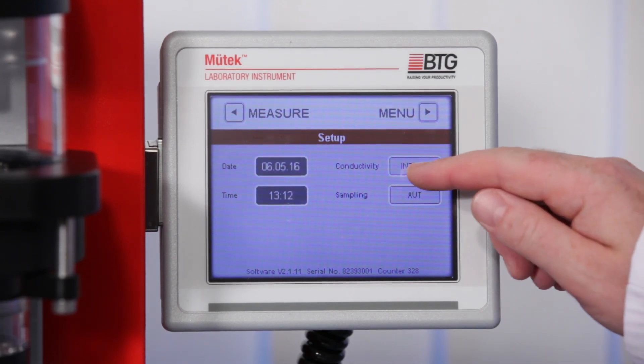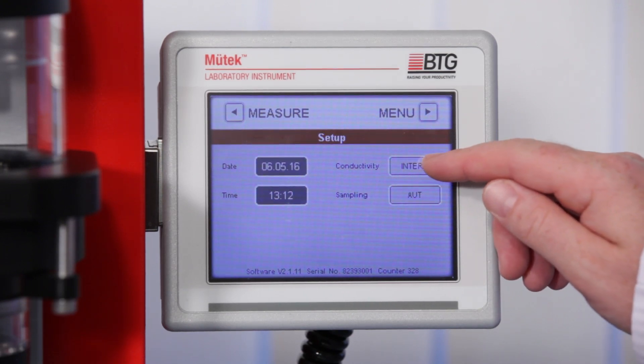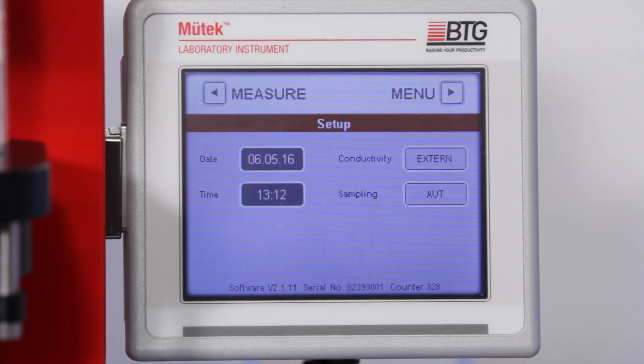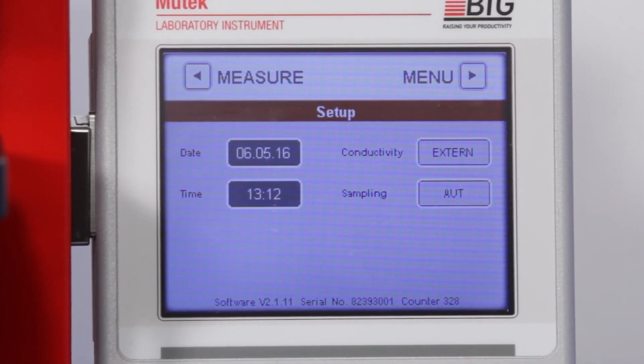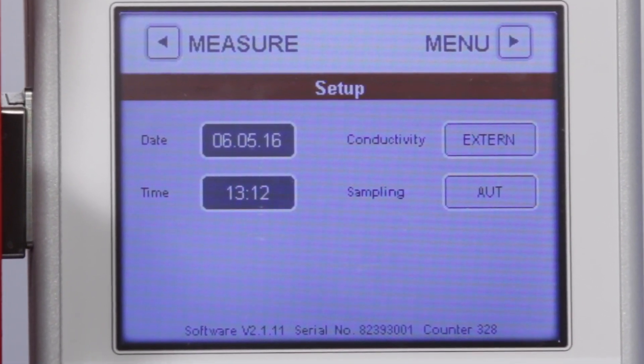As another option, you can either decide for internal conductivity measurement of the SZP, or alternatively, for calculation of the zeta potential with an external conductivity value. This external value may be entered prior to measurement.